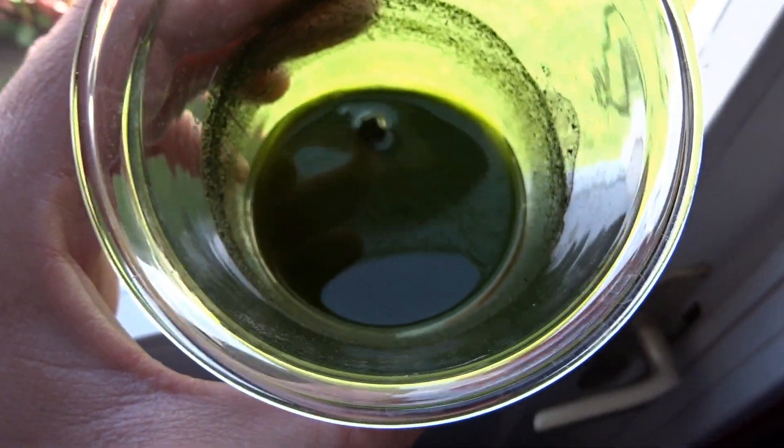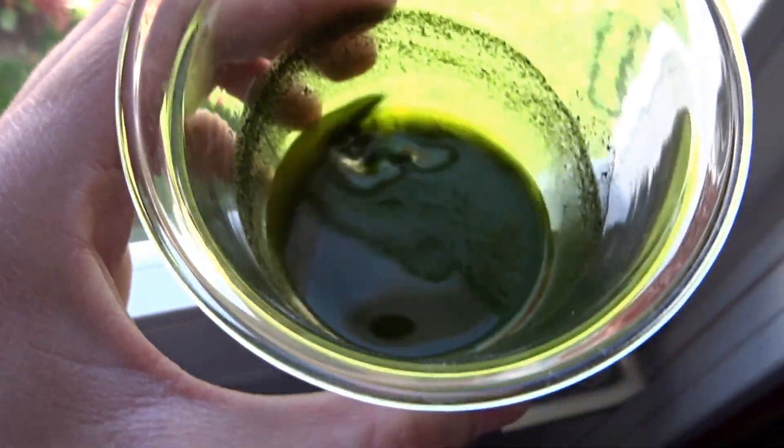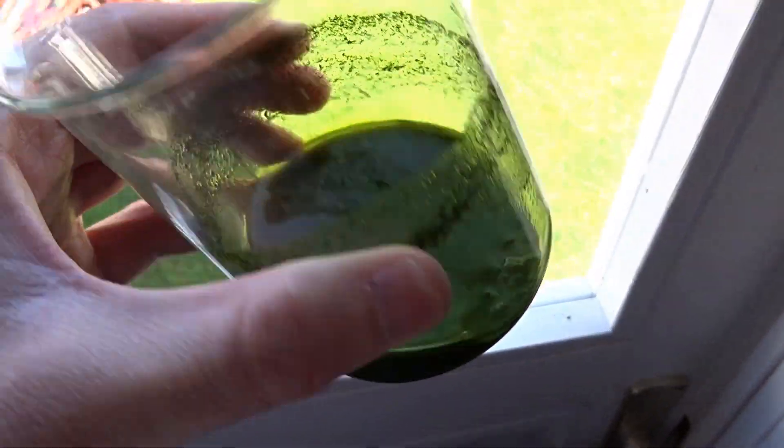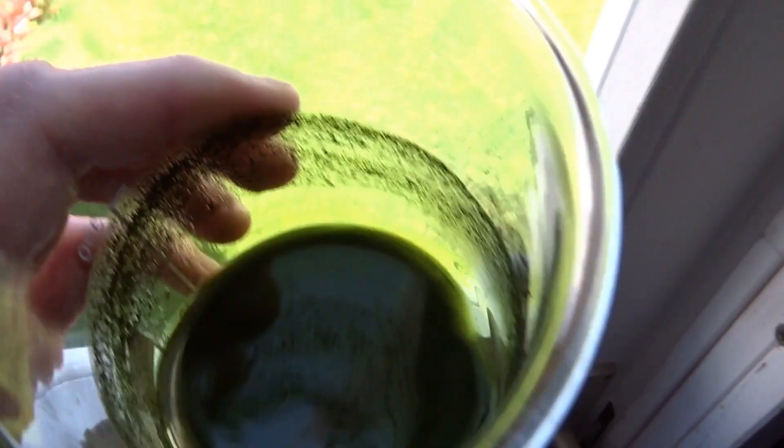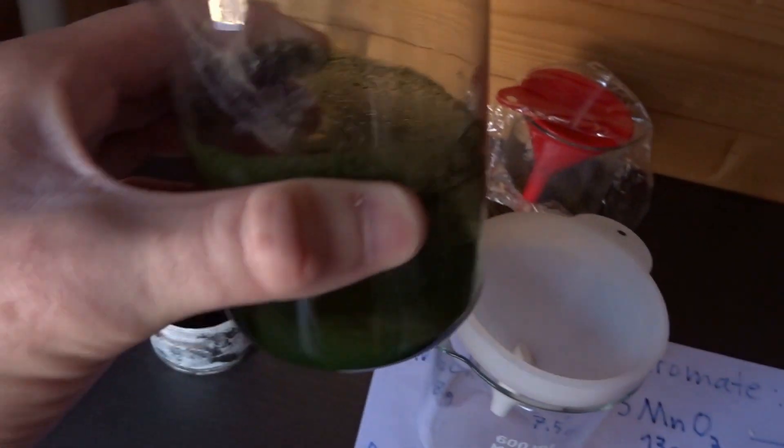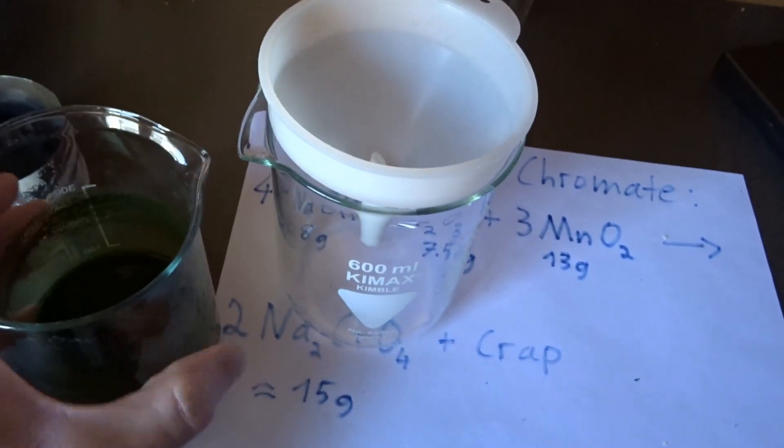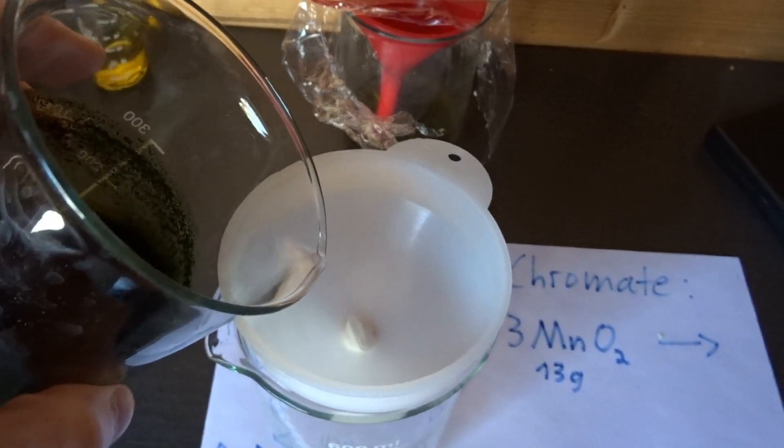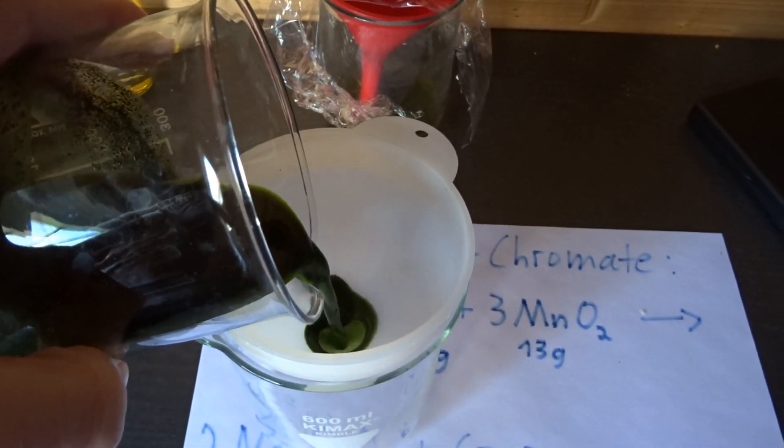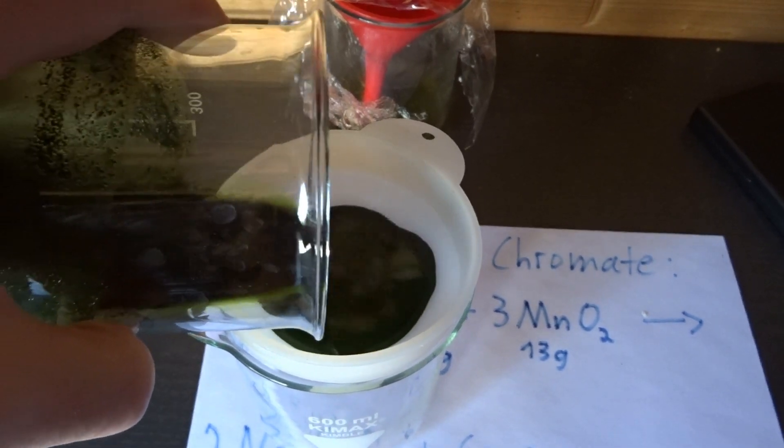So I torched it. I dissolved it in water. And it's a mixture of yellow and green. Let's see what I can get out of this green mess. A bit of yellow would be nice. Some chromates. And for that I need to filter off all the junk.